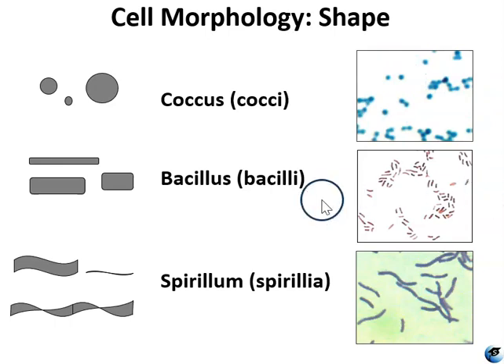In order for something to be classified as bacilli, in general, bacilli are rod-shaped, but they can look quite different. They can be long and skinny rods. They can be short, squat-looking rods. And these, a lot of the time, are misidentified as cocci, so you want to be really careful. But a whole lot of bacilli are right in the middle. They're not super thick or thin. They're not super short or long. They're kind of pill-shaped like these guys.